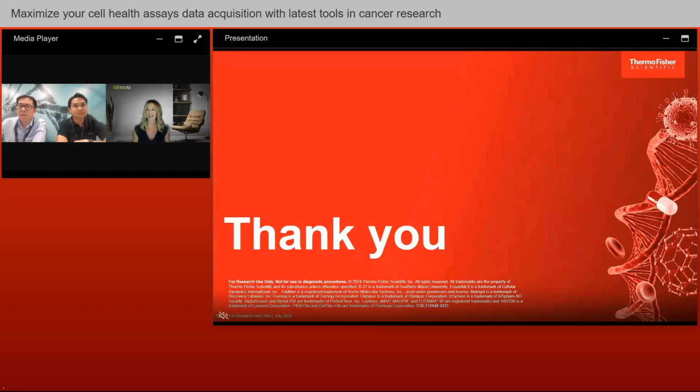Okay, so we're going to just dive right in here. Nicholas, Edmund, our first question. For plate readers, how many plates and plate types can it accommodate? And what is the reading speed?